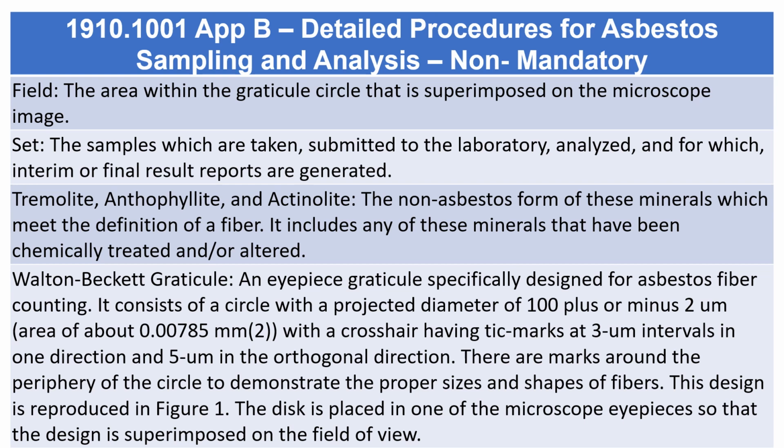Set, the samples which are taken, submitted to the laboratory, analyzed, and for which interim or final result reports are generated. Tremolite, anthophyllite, and actinolite, the non-asbestos form of these minerals which meet the definition of a fiber. It includes any of these minerals that have been chemically treated and/or altered.